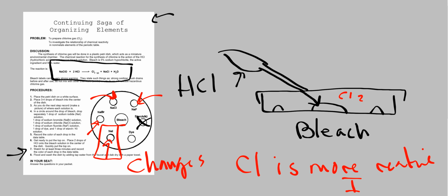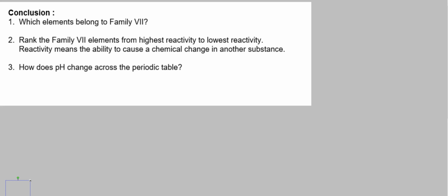Now we can ignore the Na because every single one of these has sodium involved, so we're strictly looking at the thing after the sodium. So go ahead, take this data and use it to answer those questions from the lab. These are the questions that I hope you are answering. I'm going to go ahead and answer these now.